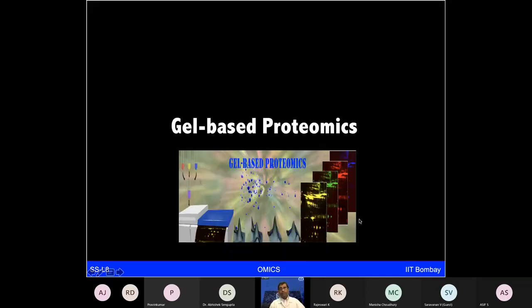So that just gives you some idea. I'm sure, as I said, many of you have done much bigger projects on chromatography. So this was very basic, to give you a flavor that different chromatographic methods are being used for separating proteins, from gel filtration to ion exchange or affinity chromatography. Electrophoresis methods are very heavily used, and after doing electrophoresis separation, you want to separate the protein from the gels, and that comes under gel-based proteomics.